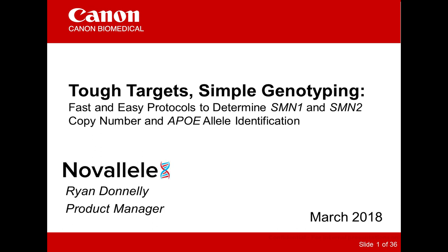Tough targets, simple genotyping: fast and easy protocols to determine SMN1 and SMN2 copy number and APOE allele identification. Presented by Ryan Donnelly, Product Manager, Canon BioMedical.